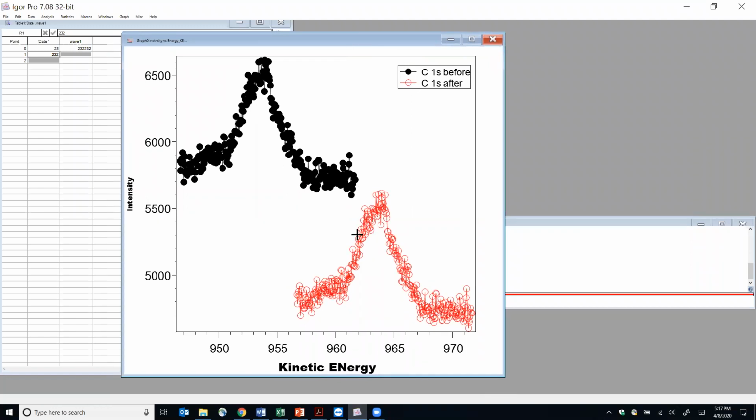Especially what I will send you first is when we measure the temperature in the system, we apply a high voltage, an emission current and a filament current, and we measure the temperature in the sample and the temperature in the manipulator. You will have a table of 5 columns. My goal is to see next time, like, imagine that.